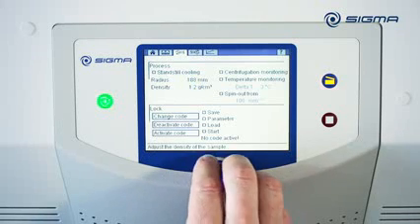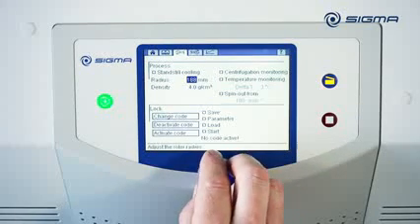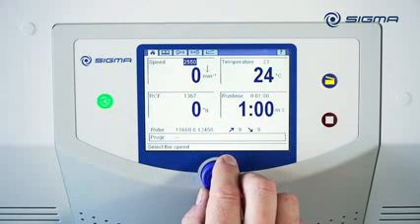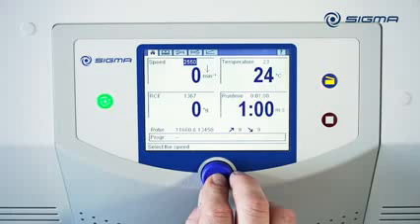To do this, you enter the corresponding density here. And on the main overview, you can see an arrow indicating that the maximum rotor speed is reduced. This way you are always on the safe side.